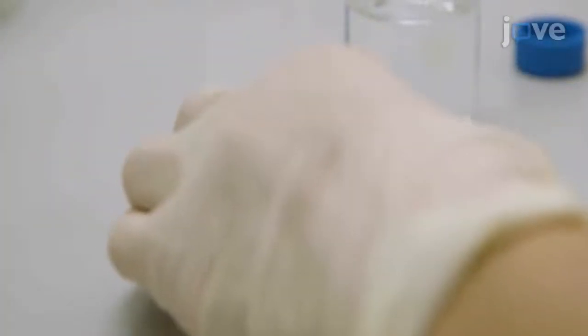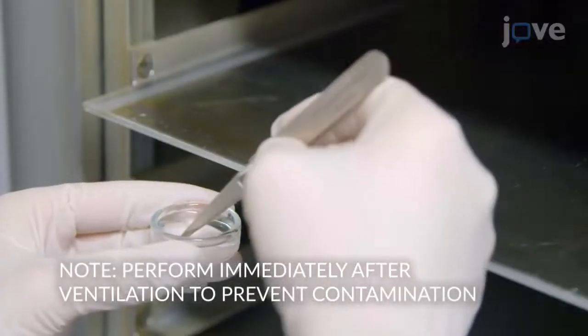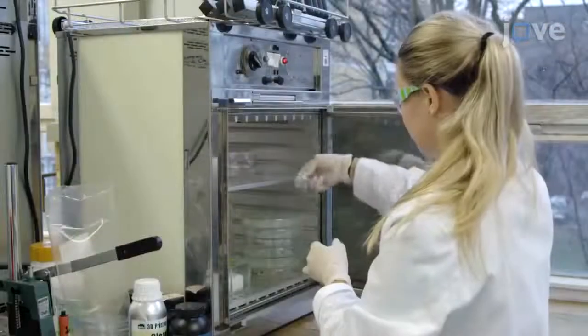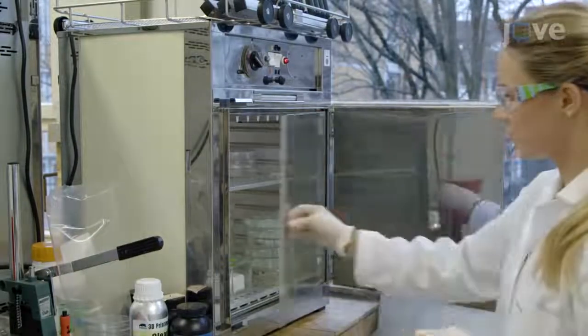After the plasma process is complete, ventilate the plasma chamber by selecting Confirm and then Venting. Proceed immediately to the next step in order to prevent adsorption of contaminants. Place the chips in the petri dish and incubate the chips for 3 hours at 60 degrees Celsius. Remove the petri dish from the oven.